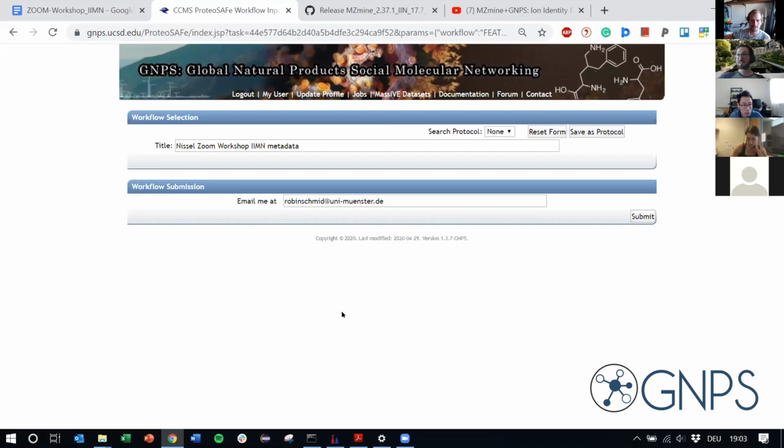You can just deselect it, run the job again, and then you have similar results to feature-based molecular networking, because of course the molecular networking edges are still from feature-based molecular networking. Okay, I'm going to stop it because it doesn't seem to work.